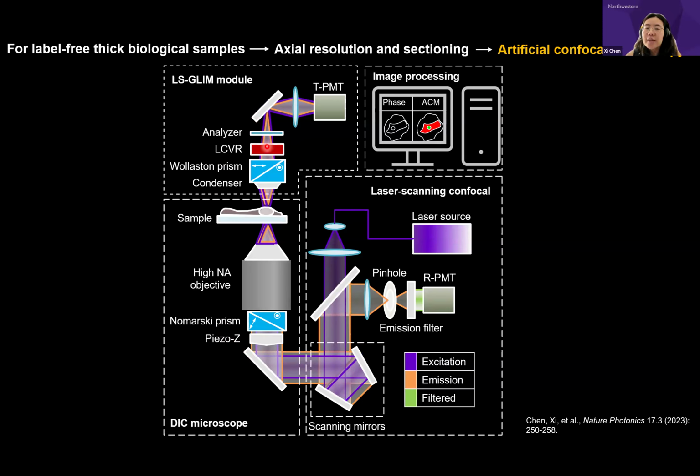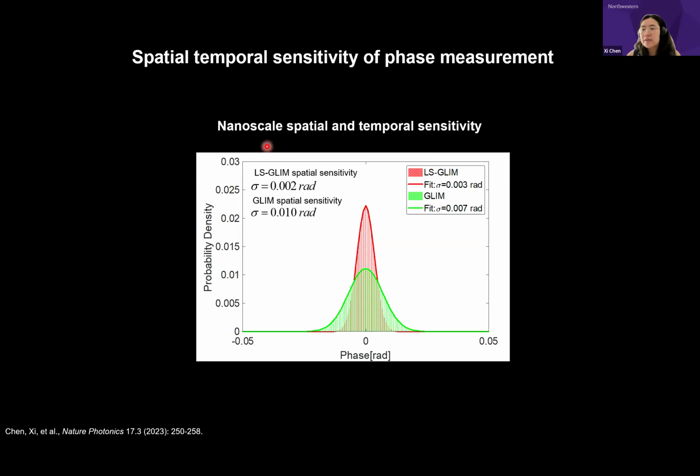Then, using the phase shift algorithm, you can retrieve the phase of the object. So using this multimodal system, we can have a colocalized pair of QPI images and confocal fluorescence images. We use those pairs of images to train the network. After the network is trained, when you input label-free QPI images, the network will tell you the corresponding fluorescence images that you trained on.